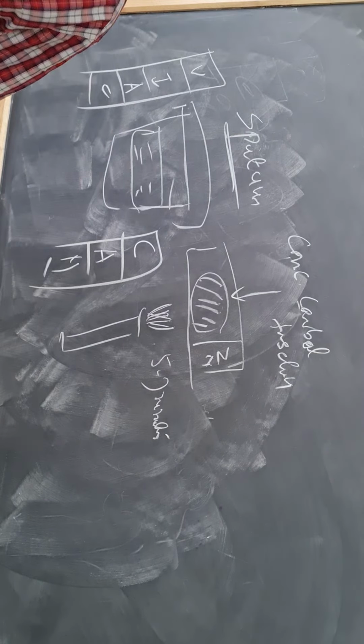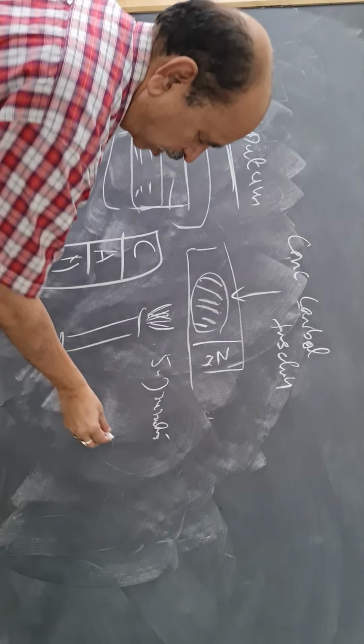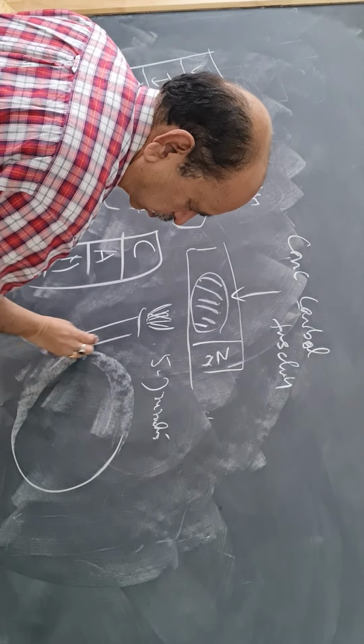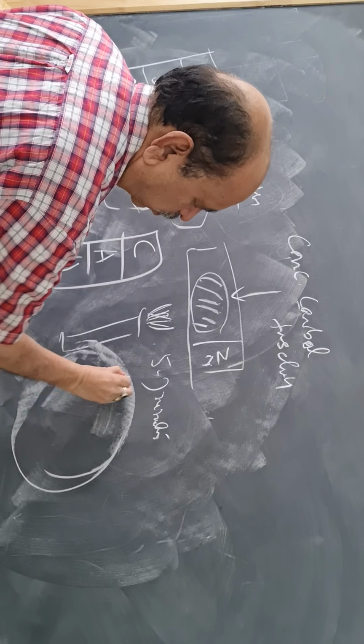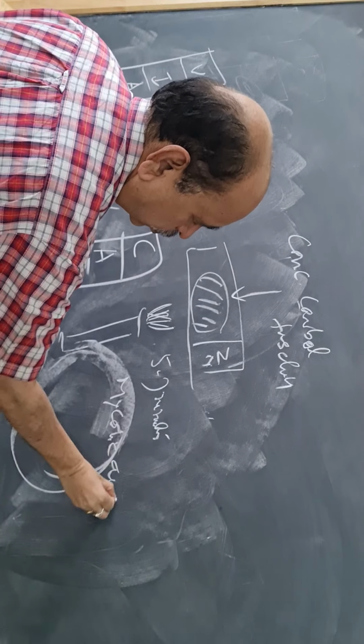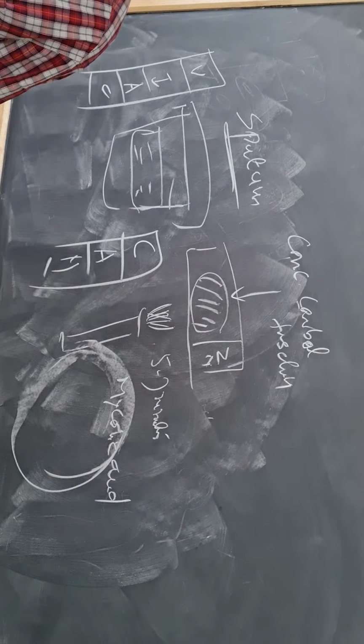This makes the dye go inside the cytoplasm, because it is not easily stained by gram stain, as it has a thick wall made up of mycolic acid.